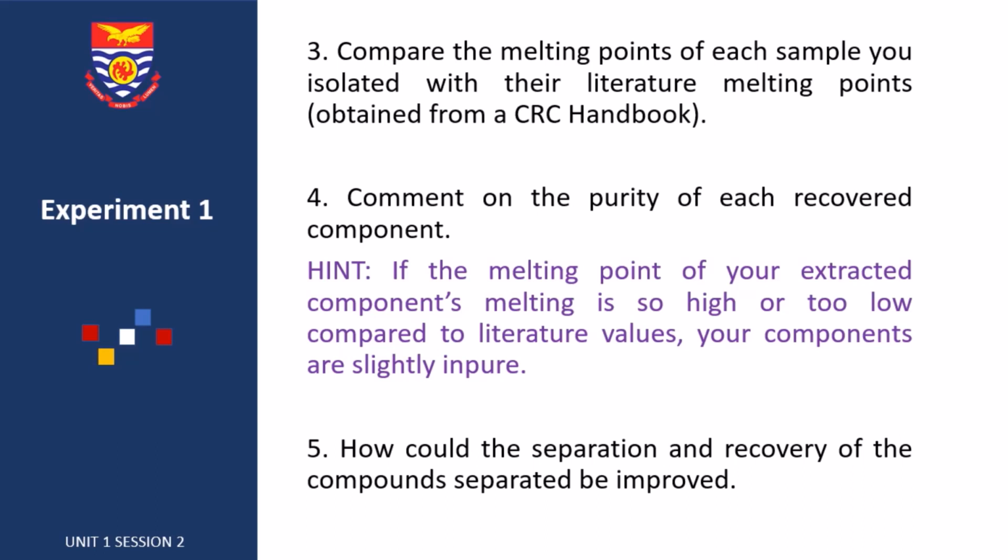Then, of course, the last thing you would want to talk about is how the separation and the recovery of your compound separated could be improved. Whilst you were extracting your compounds, is there any other process that you feel needs optimization just to increase the efficiency of that extraction process? Is there any other thing you feel like you can add or do that will improve the separation or the recovery of the component?